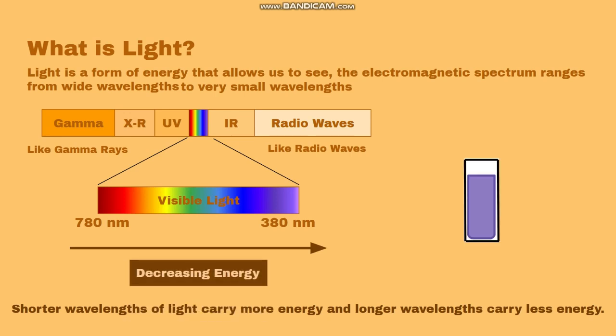The Beer-Lambert law is a principle in spectroscopy that relates to the absorption of light in properties of the substance where the light is passing. It is expressed in the equation shown here. A is for absorption, epsilon is the molar absorptivity, b is the path length of the light through the solution, and c is the concentration of absorbing species. Another way of seeing this is absorption is directly proportional to the molar absorptivity, to the path length through the light, and to concentration. So, for example, if concentration was to increase, then the absorption would increase.